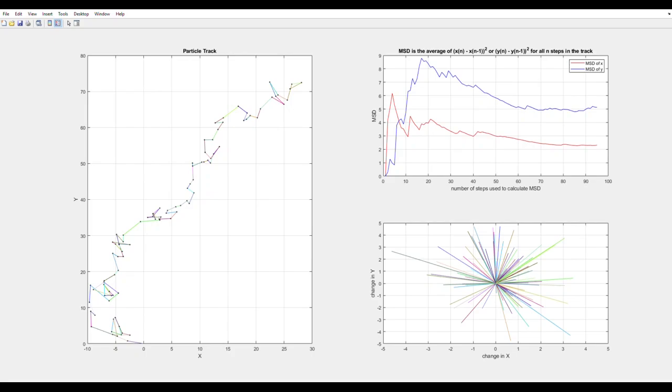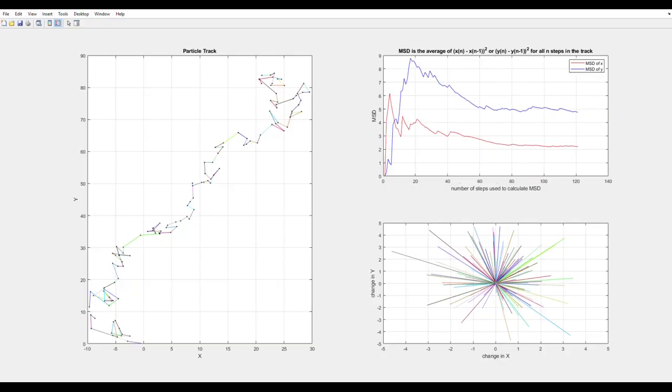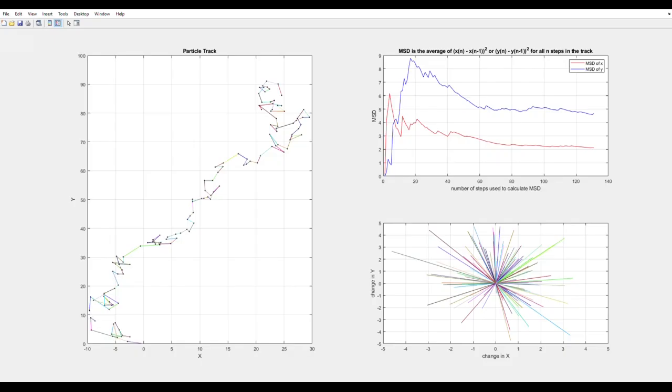Sometimes the particles drift in x or y coordinates because the slide might not have been closed on the side, or some liquid was diffusing out, or the UV LED light was heating one side of the slide. We tried to be very careful with slide preparation to minimize this effect. Wrap the sides of the slide with saran wrap and turn off the equipment to let it cool to equilibrium room temperature, and then perform a 60-second recording.